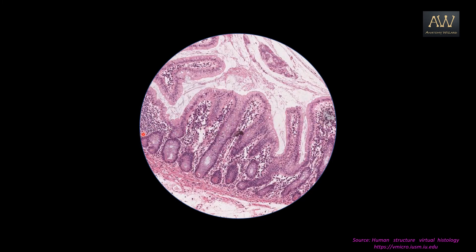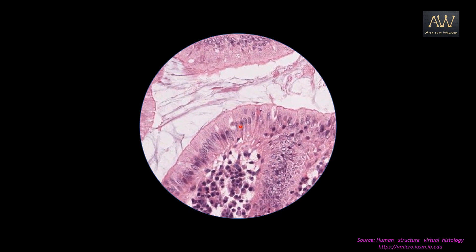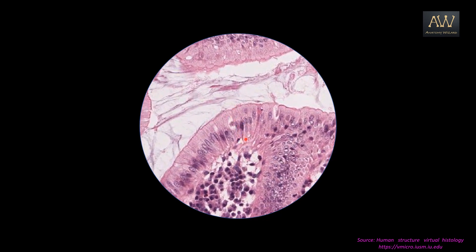Again in this slide, we need to observe the junction of the free space and the tissue. So let us zoom in a bit. Here you can clearly see the presence of oblong or oval shaped nuclei which are present in a single layer. Zooming in more, you can clearly see the columnar shaped cells with the oval nuclei, which are rather more towards the basal surface of the cells. So this is a typical example of simple columnar epithelium.